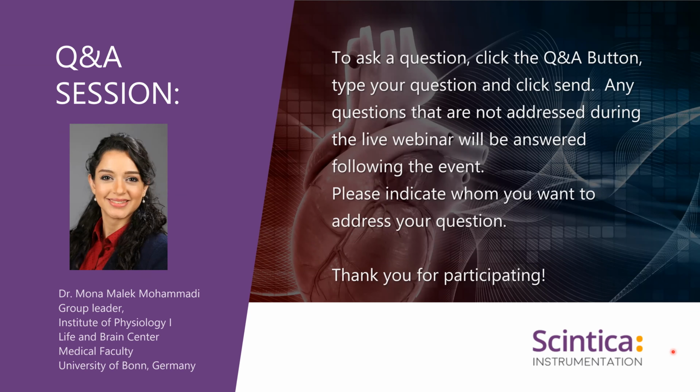That's a great point on the cannibalization. It's something that people have to be aware of and account for. Based a little bit on that, the next question I was asked is, what is the mortality rate that you find in your surgeries and after? In the neonatal TAC model, like in adults, the mortality rate is 10 to 20%. But in neonatal, we have to consider that there might be a lot of cannibalization going on.